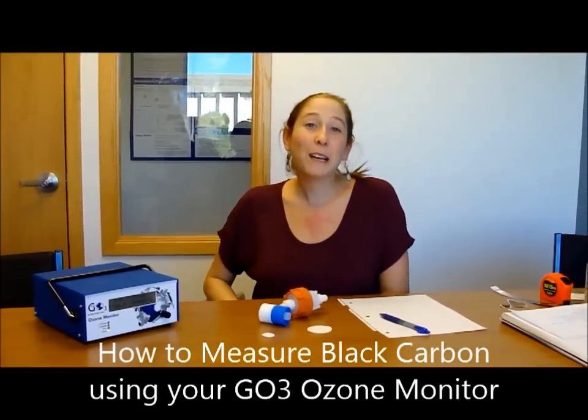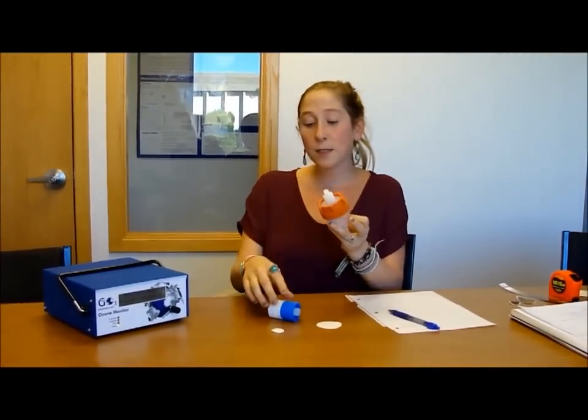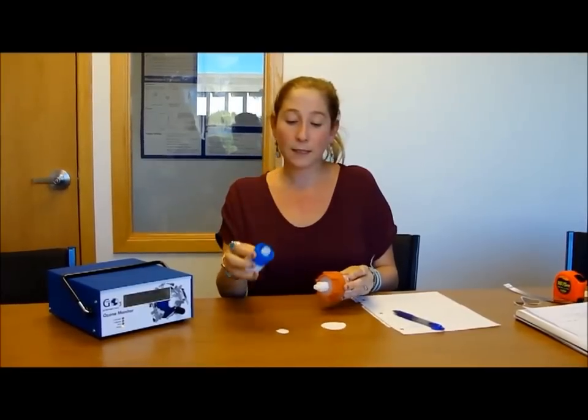Hi, today we're going to take a black carbon measurement using your particle filter and your ozone monitor. The black carbon measurement is measuring basically the amount of soot in your atmosphere, which will depend on your environment and your location. Now you're going to have either an orange and white particle filter housing like this or a blue and white one like this.